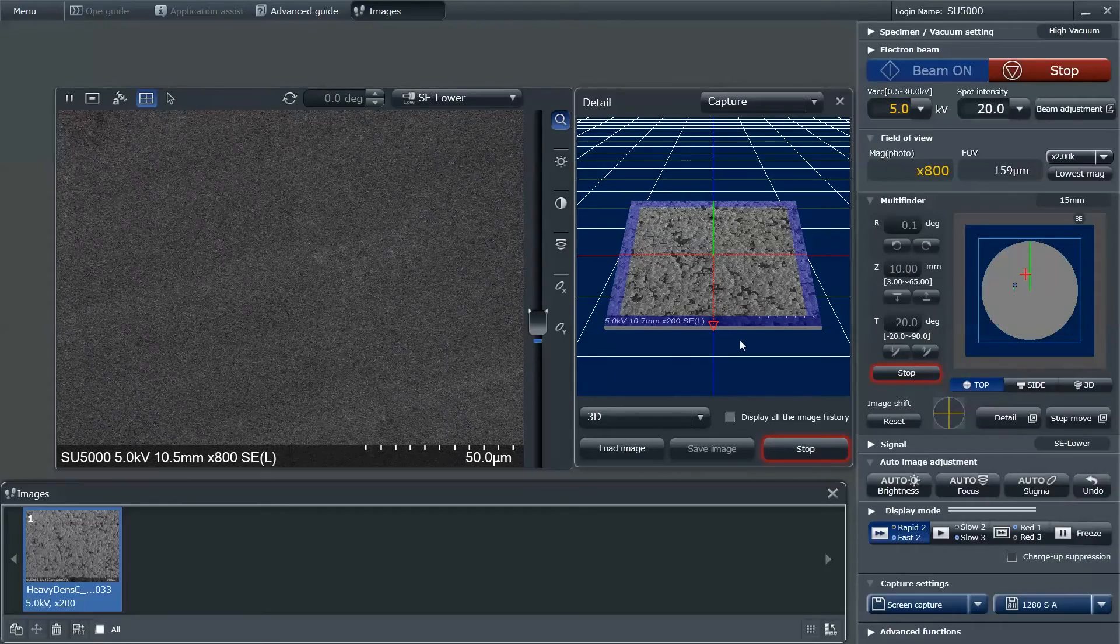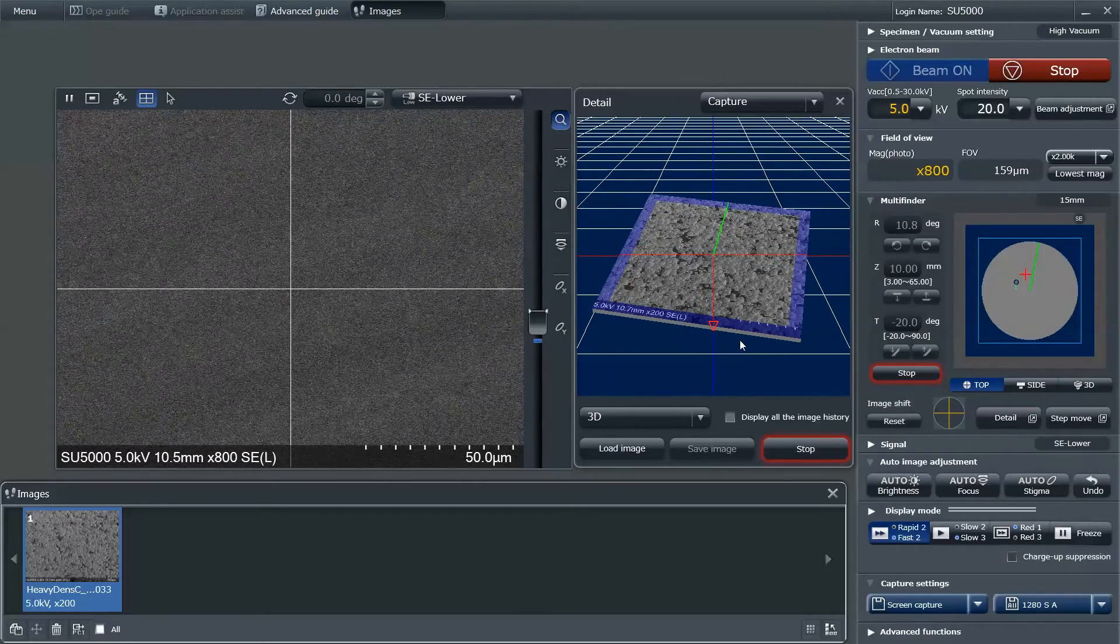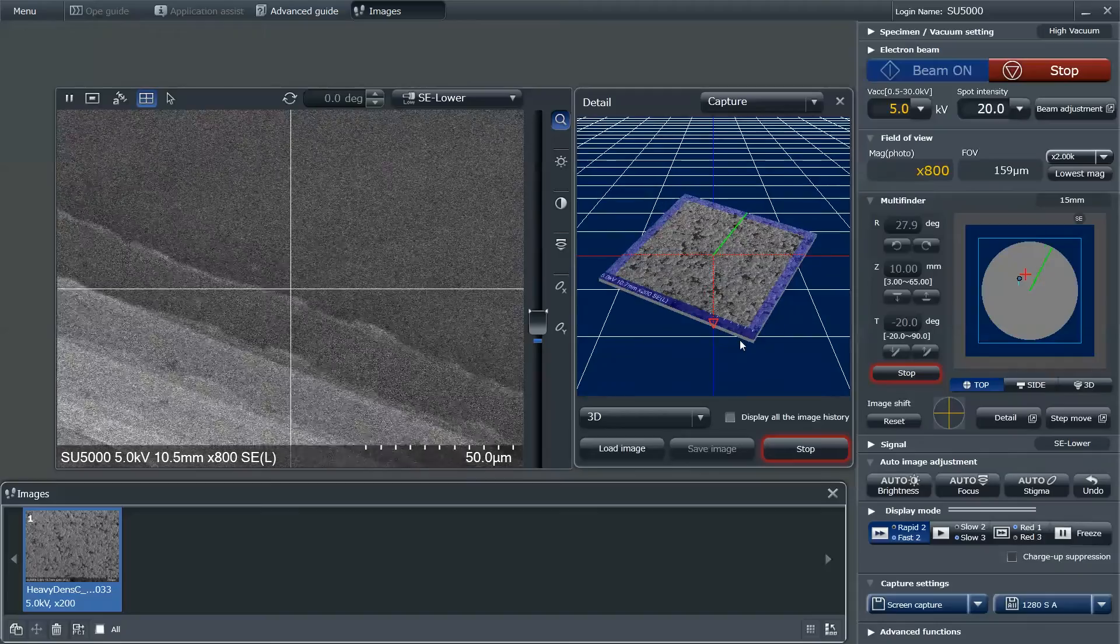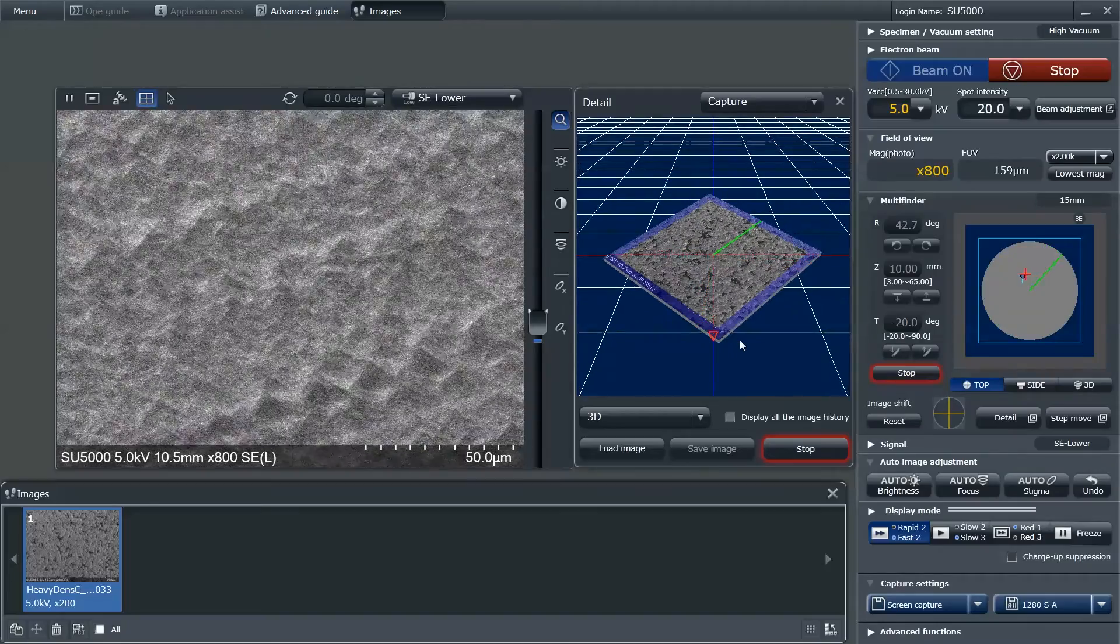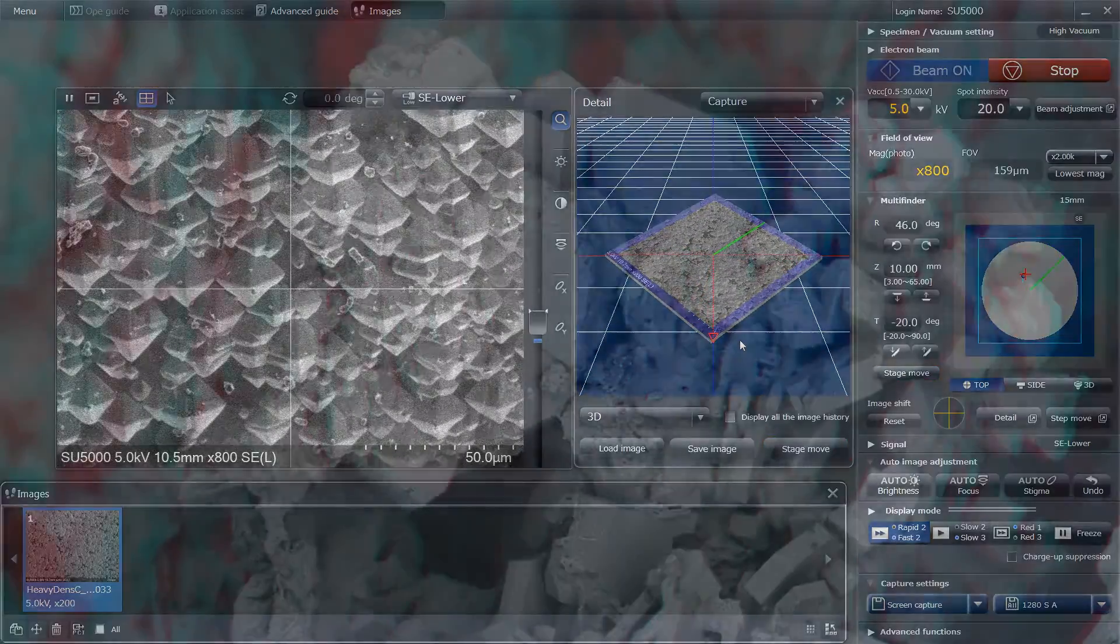Continuing to augment Hitachi's list of designed-with-the-user-in-mind software algorithms, the SU-5000 also incorporates the real-time 3D stereoscopic image observation capability at the single push of a button, a feature well-received and first introduced in the ever-popular SU-3500, Hitachi's 3D variable pressure SEM.